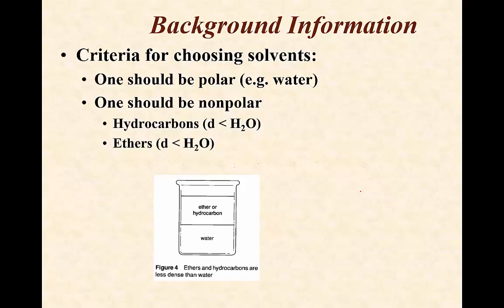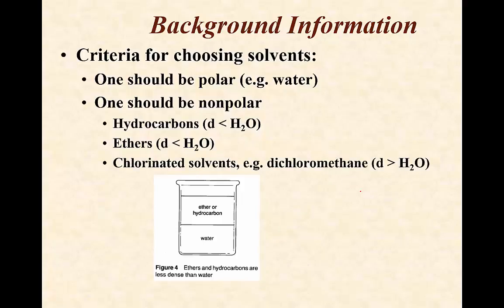Now, we've also used another type of solvent, chlorinated solvents like dichloromethane, and that's the solvent that we used for extracting the caffeine from the tea.